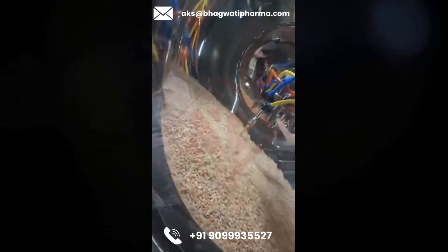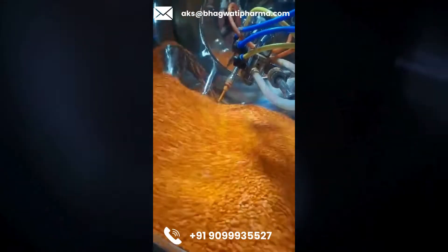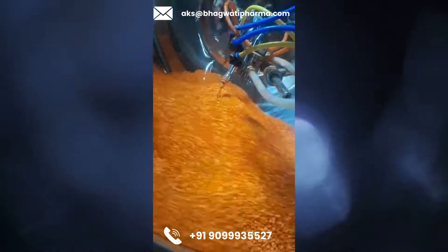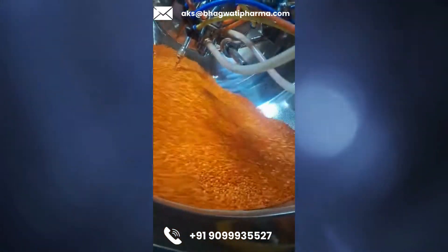Second, Spray System — a mechanism for spraying the coating material onto the tablets as they tumble inside the coating pan. The spray system typically consists of nozzles or spray guns that deliver the coating solution or suspension onto the tablet bed.